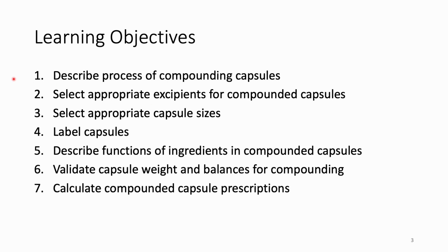After taking this lecture, students should be able to describe the process of compounding capsules, select appropriate excipients for compounded capsules, select appropriate capsule sizes, label capsules, describe functions of ingredients in compounded capsules, validate capsule weight and balance for compounding, and calculate a compounded capsule prescription.